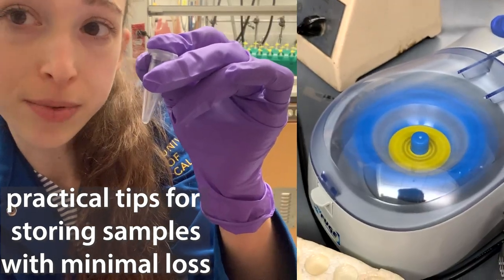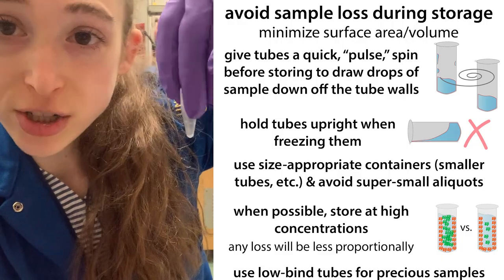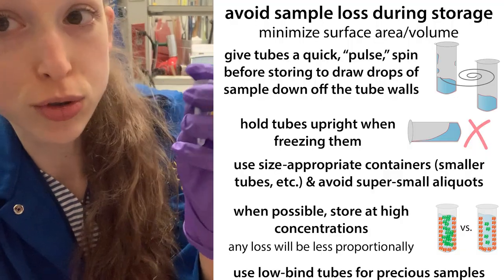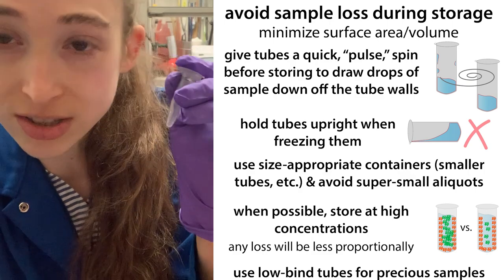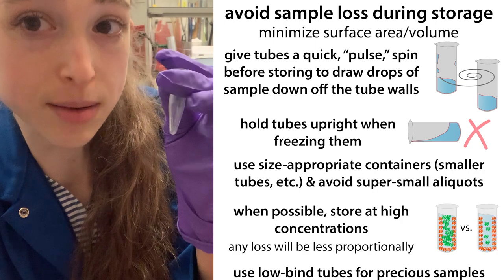Be sure to give your sample tubes a quick spin before you store them. When you're freezing them, especially flash freezing, make sure that they're standing straight up, and try to, if possible, store your samples at high concentration. These are just a few tips that will help prevent sample loss.